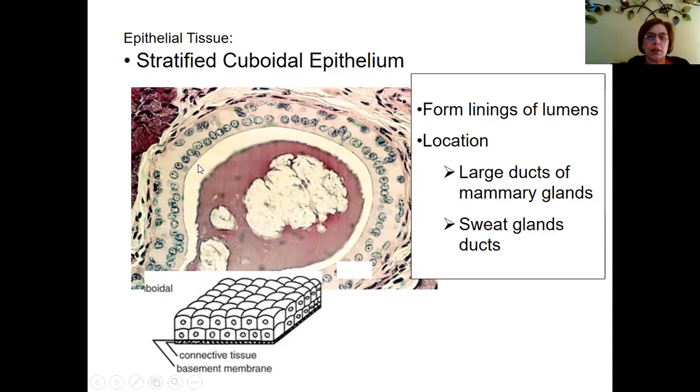All right, this is a mammary gland. So this is going to be my lumen here in the center, and the row of nuclei. Anytime you see distinct rows of nuclei, that's a tip off you're looking at an epithelial tissue. If you look, I have a row of nuclei here, and these are too short to be columnar. If I drew a box around that, that's definitely got to be cuboidal. And if you look underneath, here's a second row of cuboidal.